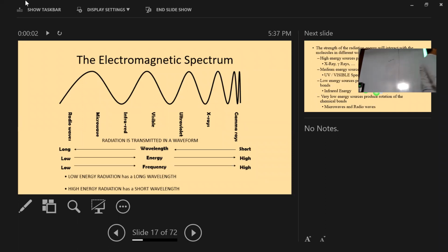So if I put one lens in front of the laser, the lens can focus. You are familiar with the lens. If we put a lens like this and give some light, the light comes to this point, the focal point.